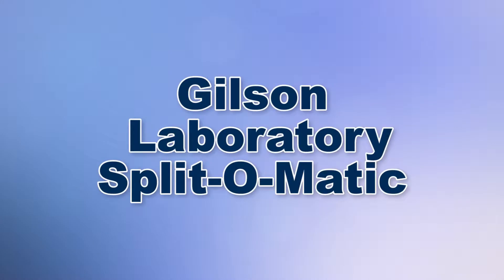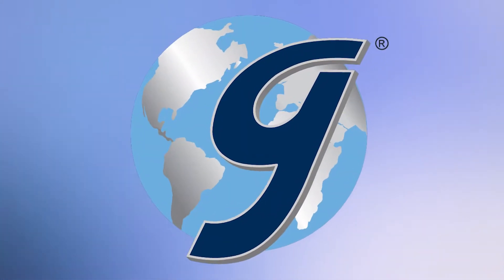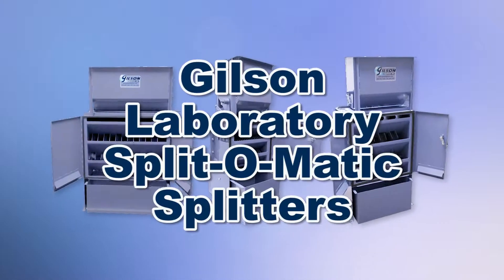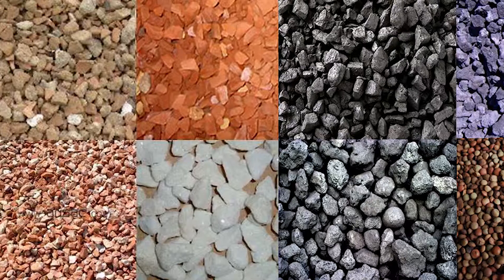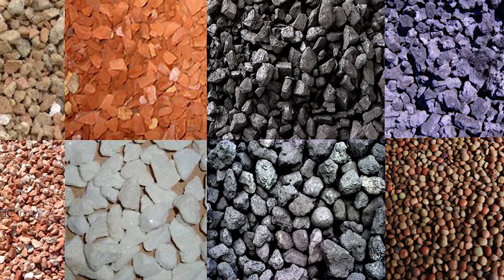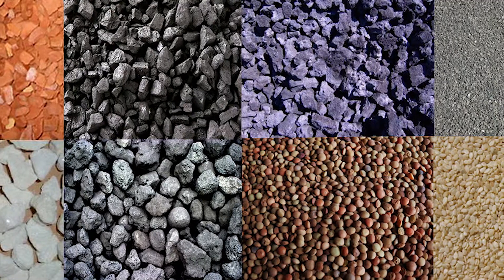When your laboratory requires large samples to be quickly and accurately reduced, Gilson is your best choice. Gilson's Splitmatic splitters will process bulk samples of a wide range of granular material into smaller representative fractions for efficient preparation of test specimens.